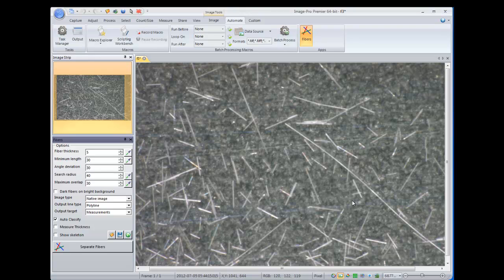Today we'll review the Fiber Separation Analysis app for ImagePro Premier software. This app can be freely downloaded from Media Cybernetics Solution Zone website.